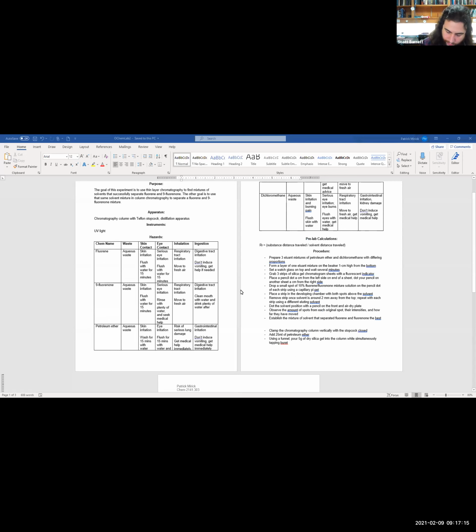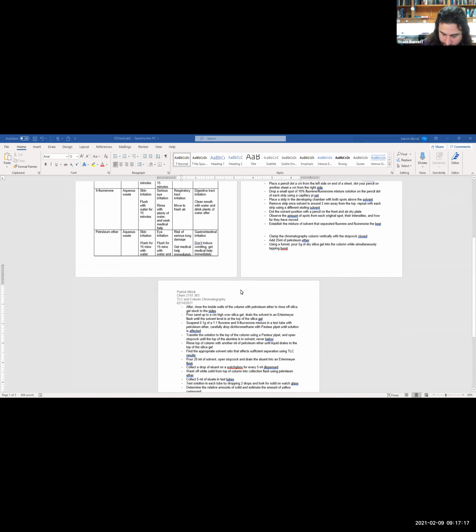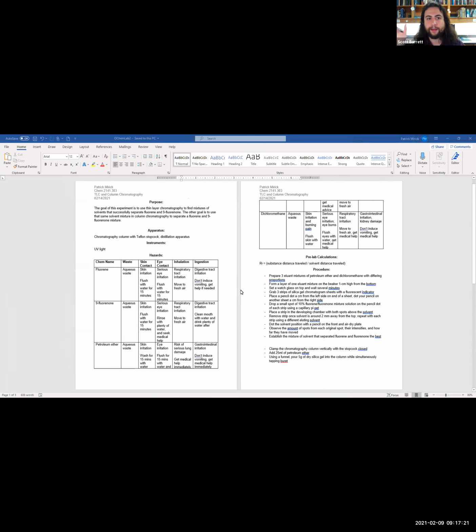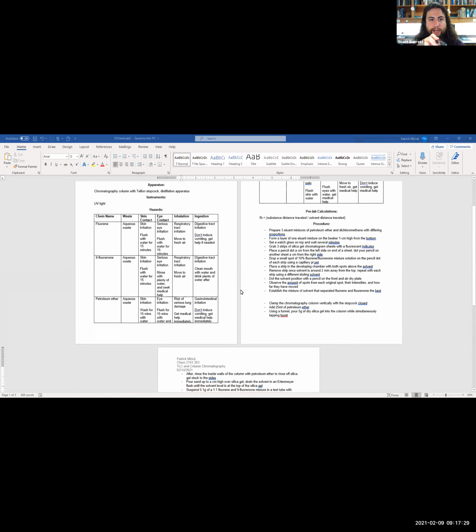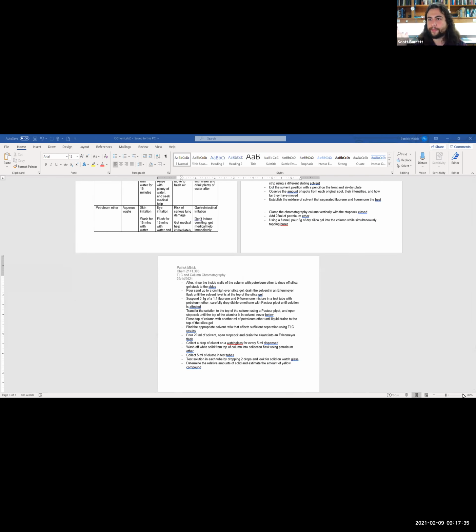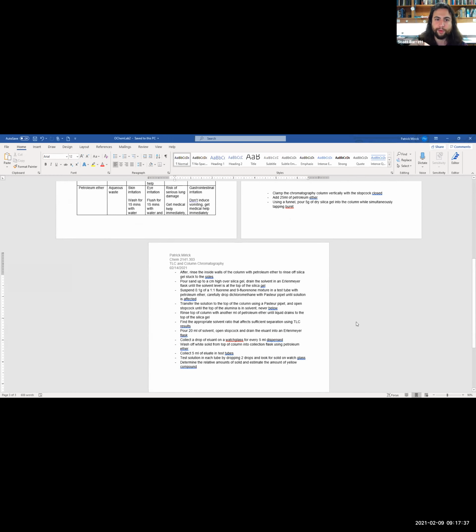And make sure, Nadia, whenever you write up your pre-lab, just as a helpful hint, because this is going to be more relative to when you turn your lab in, make sure and do kind of like, you see how these students have the hazards, the list of all the chemicals that they're utilizing. Make sure that you utilize a hazard table, so that you know which chemicals would be dangerous if we were going into lab. So just go ahead and add that into your pre-lab.